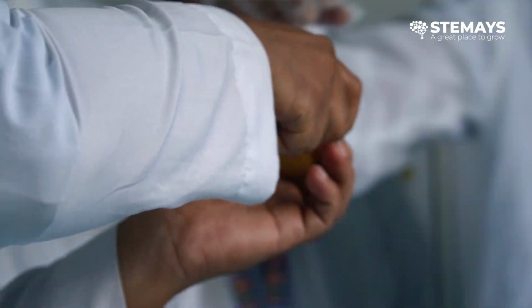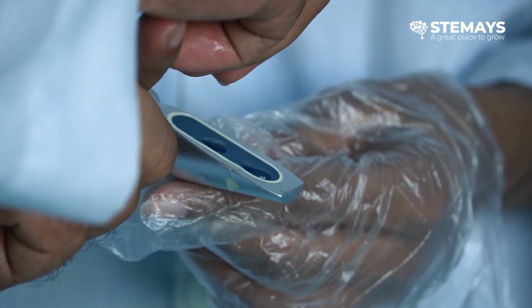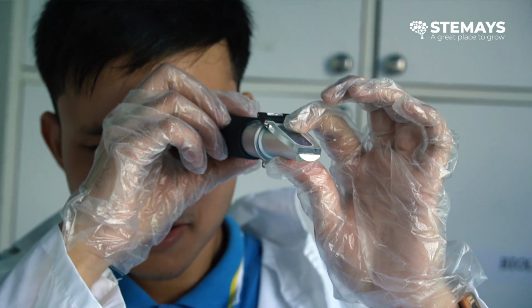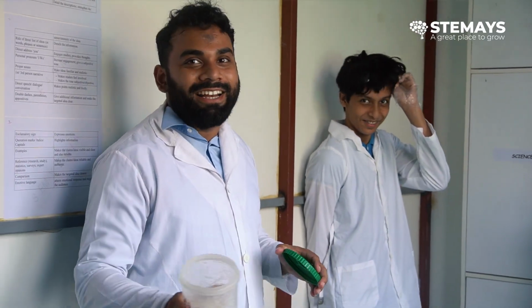We did the same thing with an apple. We squeezed the apple on the refractometer and looked in it, but surprisingly we found out that it was higher than what we found for the cold drinks bottle. It was 11. So we were pretty shocked by this. We thought that one apple had 11 grams of sugar, which was definitely not correct.